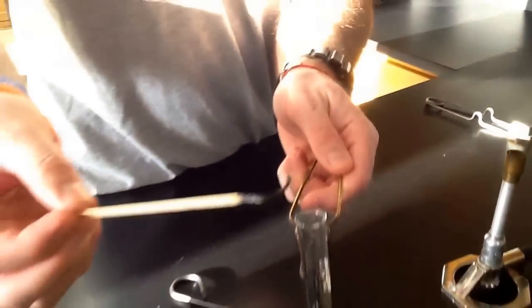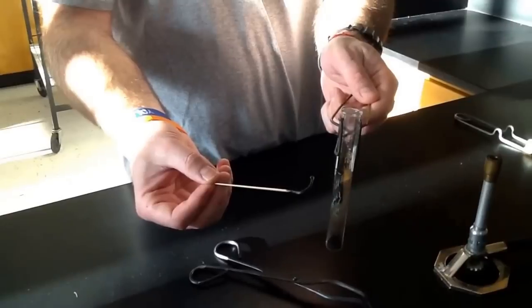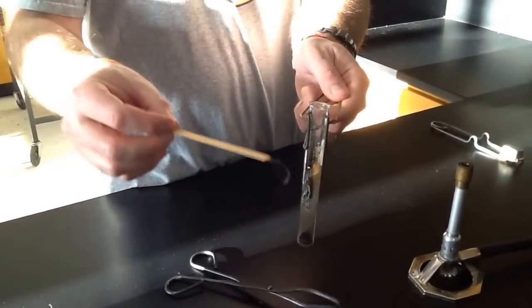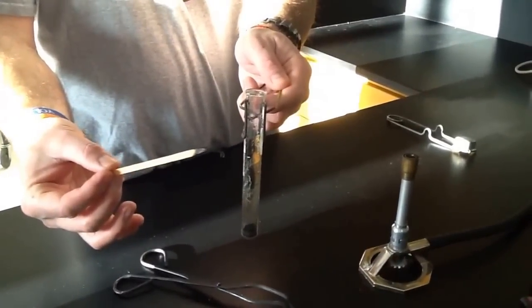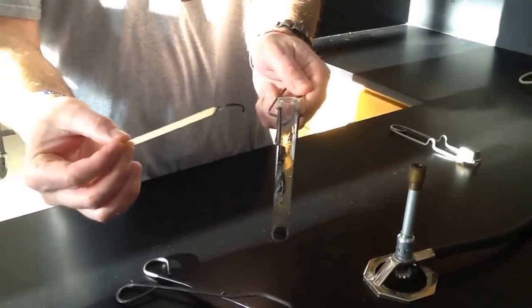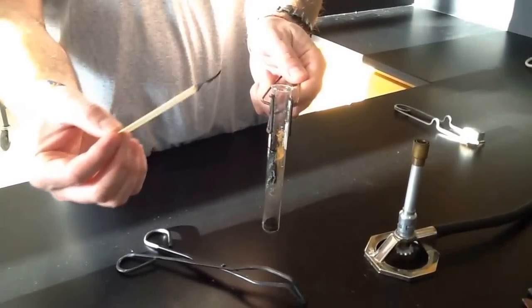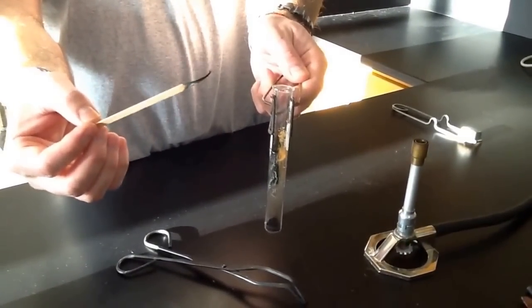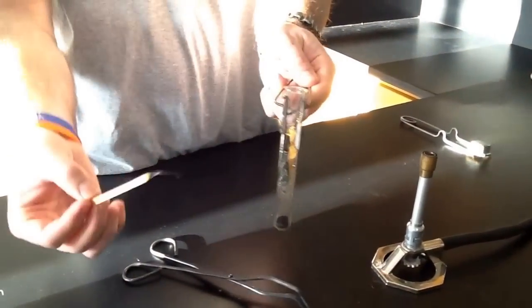ember went out because there was carbon dioxide in the test tube, and carbon dioxide is more dense than air, so that carbon dioxide stays in the test tube. And it's also not flammable and does not support combustion. So to have combustion, which the glowing ember was doing, you need oxygen. Since there's no oxygen in the test tube, when you put the glowing splint in there, it went out. All right. That was our decomposition reaction.